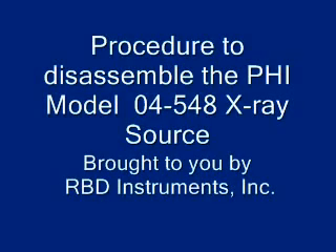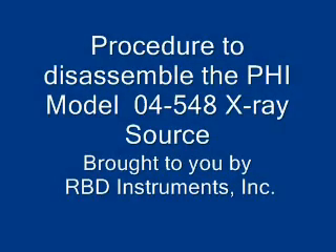Welcome to this video which will show you how to disassemble your PHI model 04-548 x-ray source, brought to you by RBD Instruments.